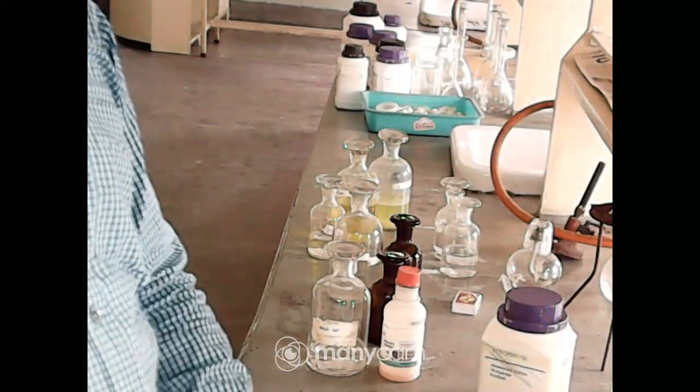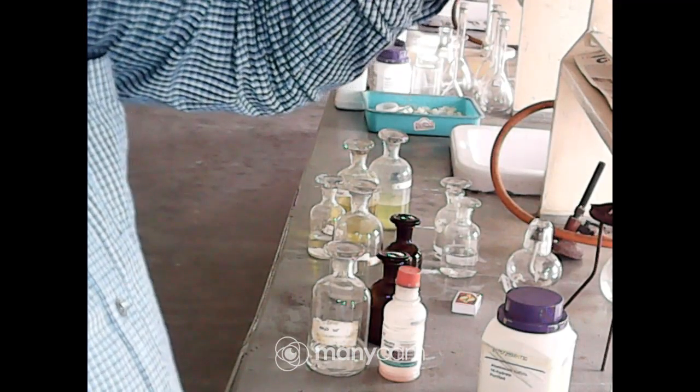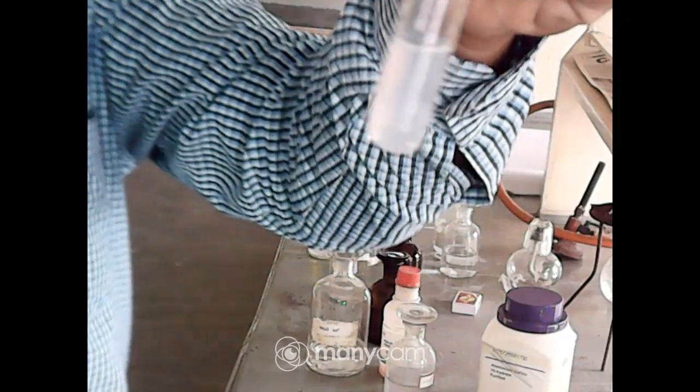This is NH4OH. Add with this. This is called the floating PPT test. Now add, you can see the PPT already comes, a light colored PPT. Now further to prove this, dissolve this PPT in HCl.